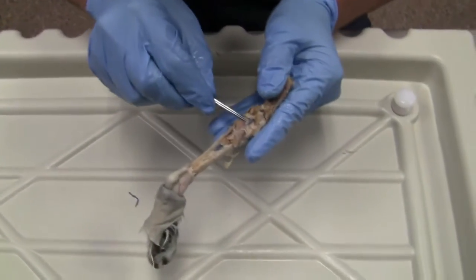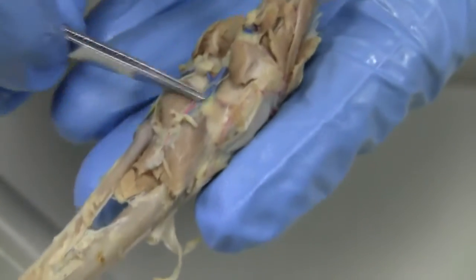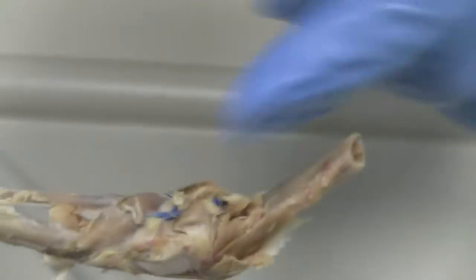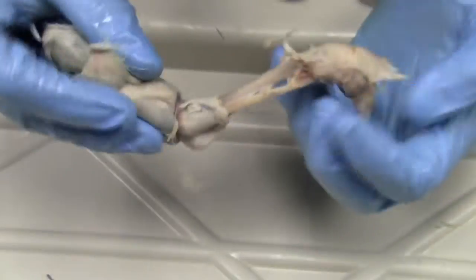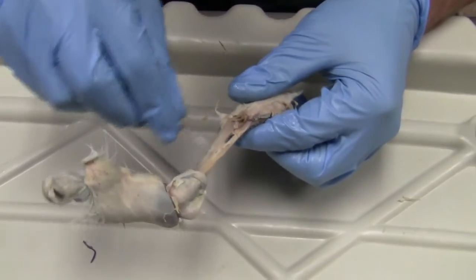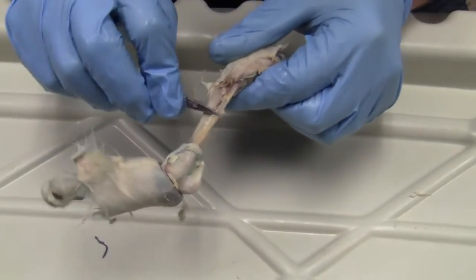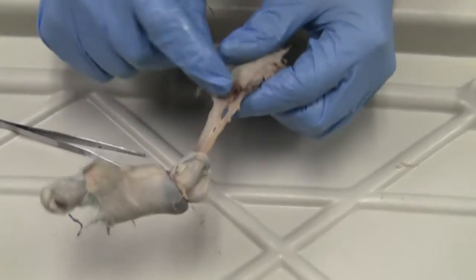Right here, that's your tibial artery and vein. So that's that artery and vein that you have to watch out for if you ever tear your ACL or PCL, so you don't sever that. And then when you get it all cleaned up, be careful with your tibia and fibula, because your fibula on the cat is pretty thin, so you don't really want to cut that because it can get cut by scissors.